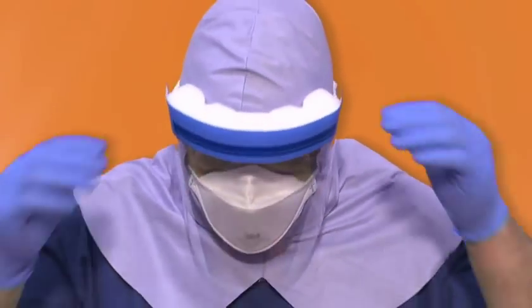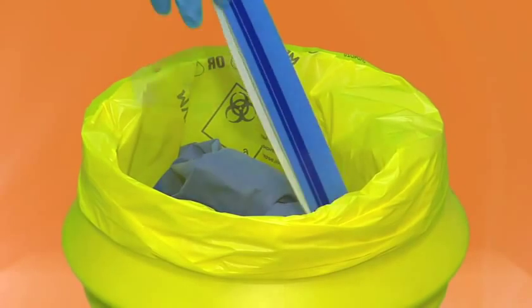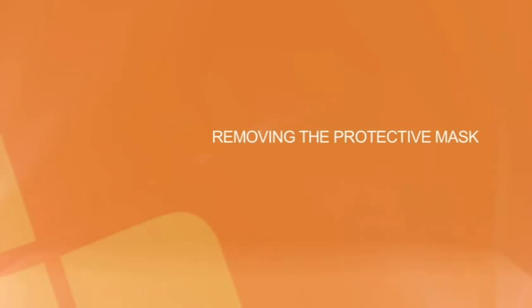Visor or goggles. Grasp the visor strap and pull forward. Lean forward and hold the visor or goggle strap carefully and pull away from the face. Dispose of the visor or goggles as clinical waste in a yellow bag.